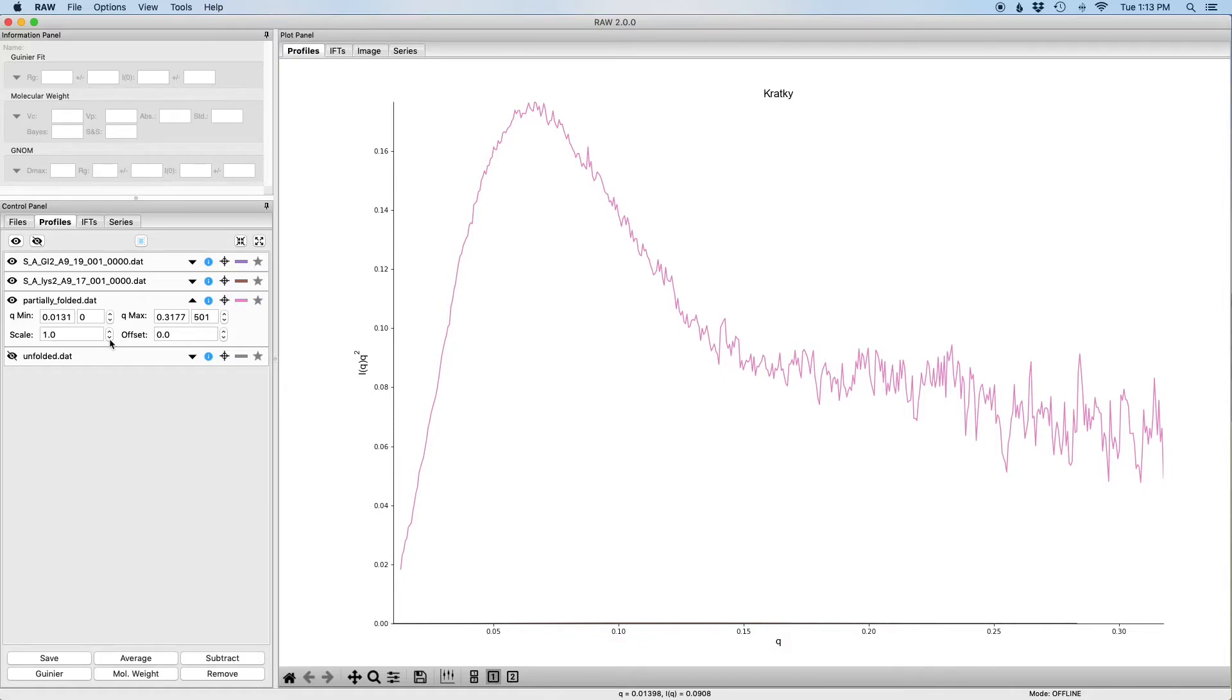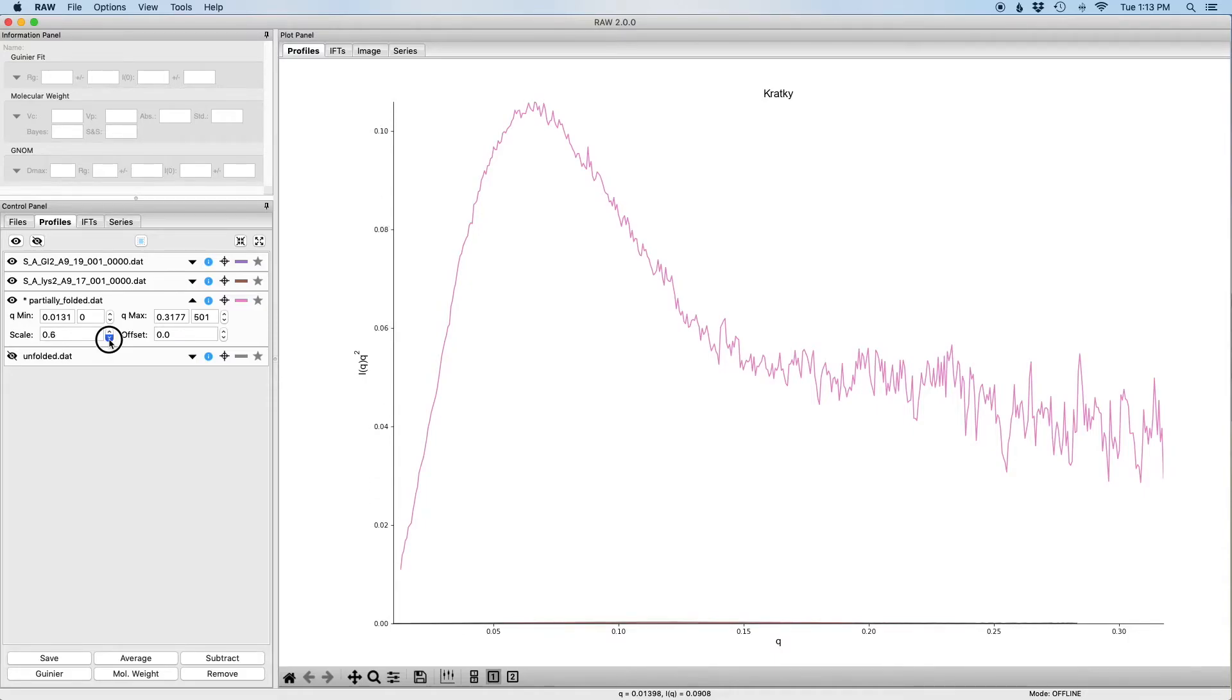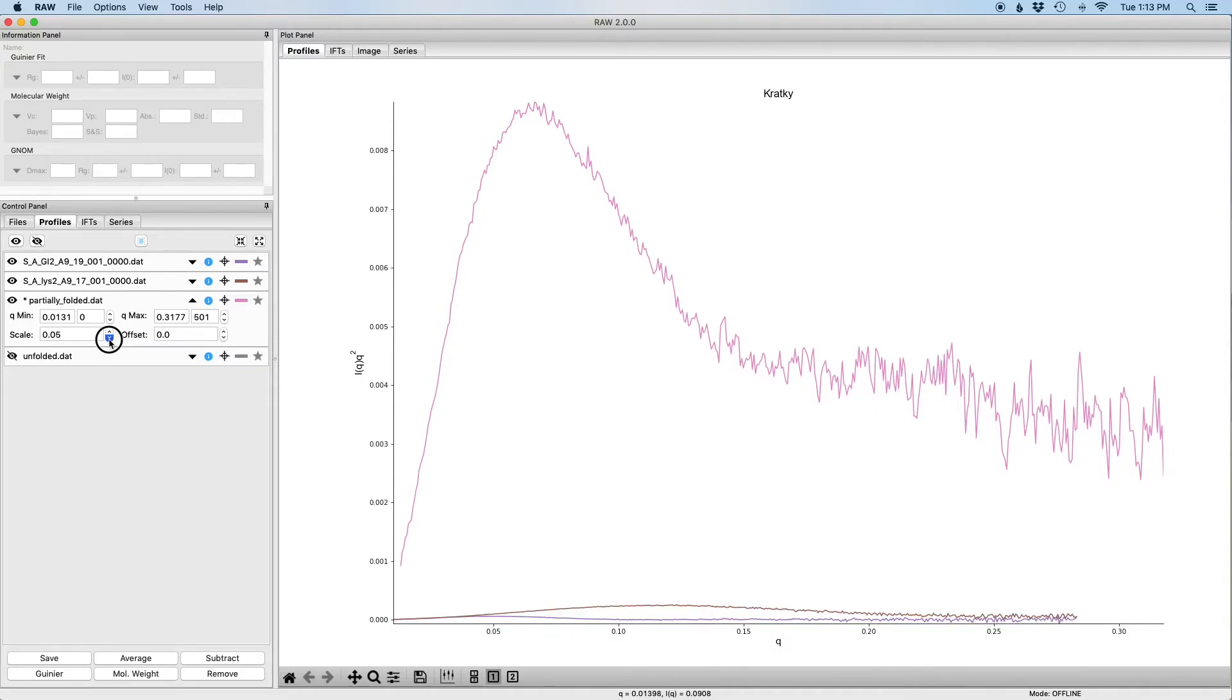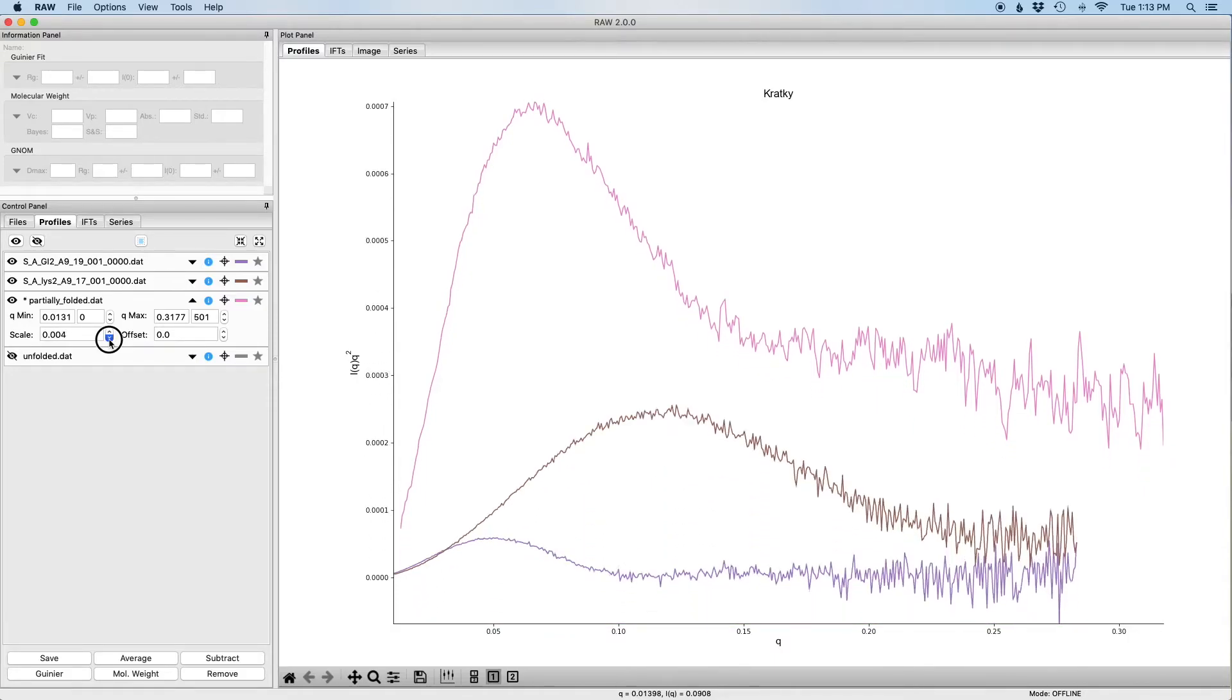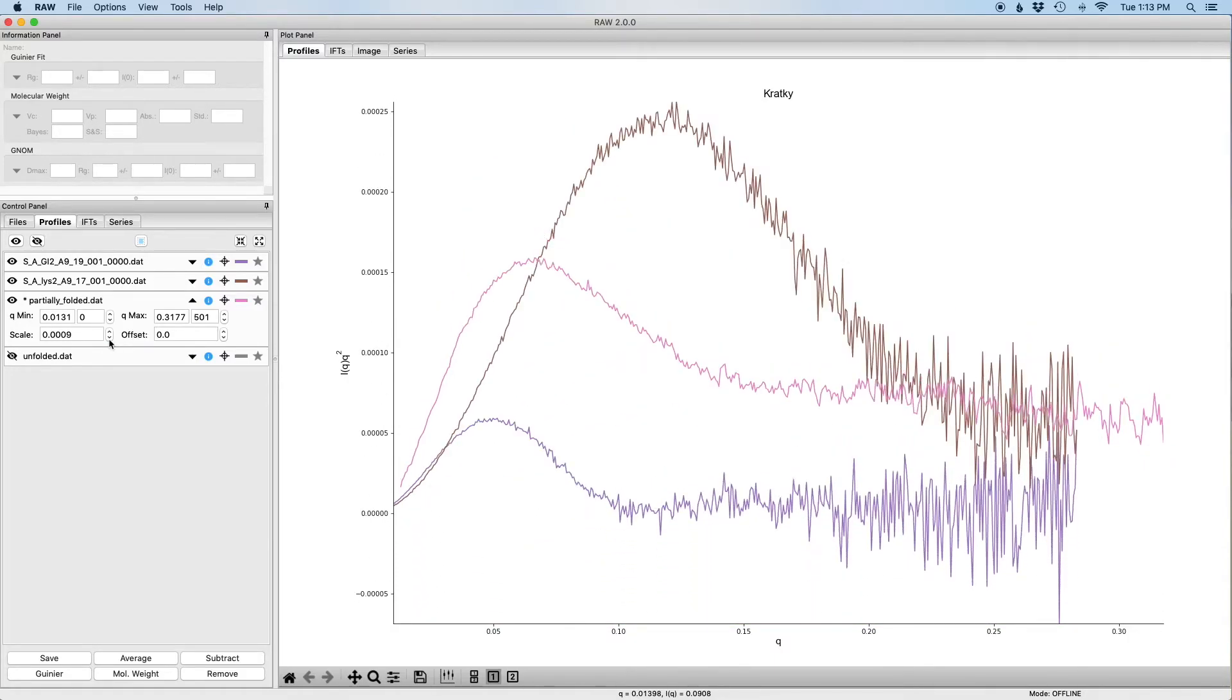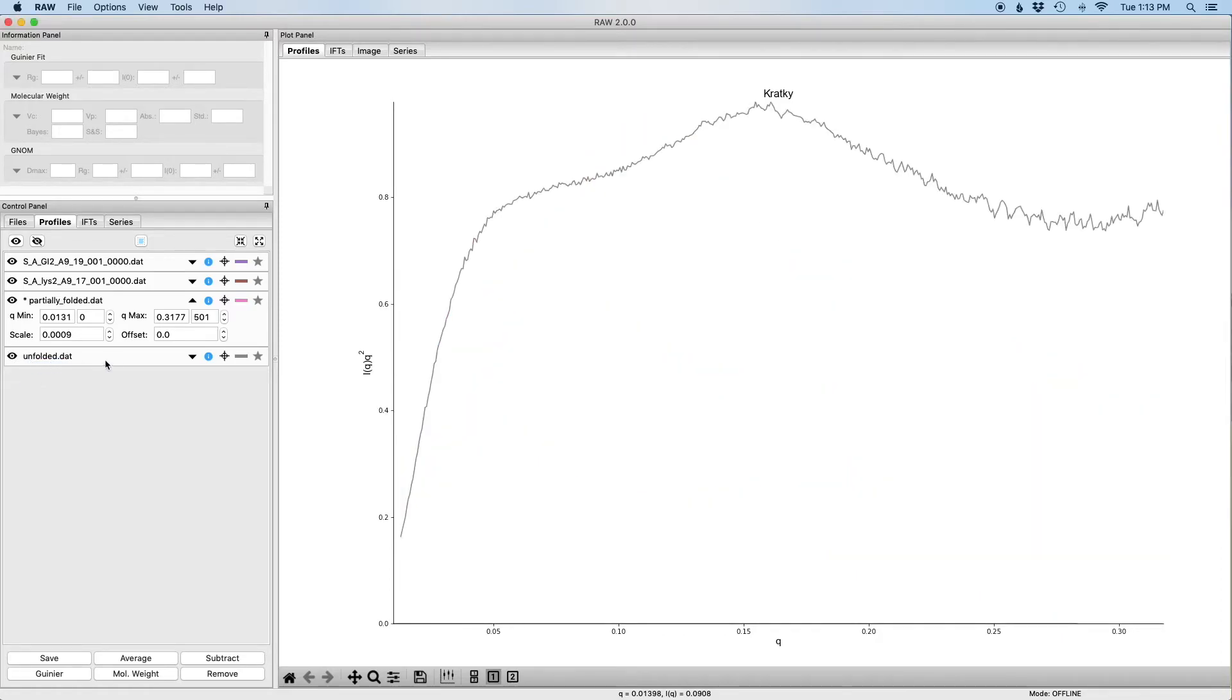So what I'm going to do is I'm going to apply a scale factor that's less than one and I'm just going to keep changing the scale factor until it gets close to where the glucose isomerase and lysozyme data sets are. To do that, I'm just going to hold down on this down arrow and you can see the scale factor scrolls and you can see that now we've scaled it to be on the same scale as the other data sets.